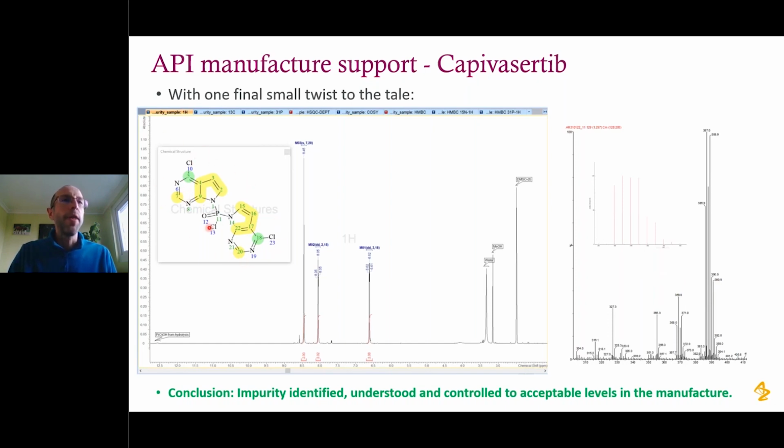And then once we have that structure, we obviously understand its formation, we understand the consequences of it being present in our material. I can make sure that we control and manage any risk associated with that.